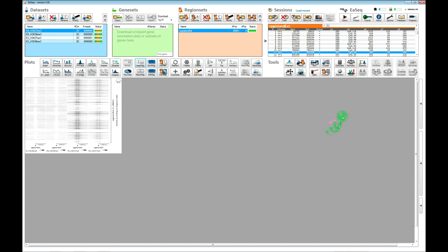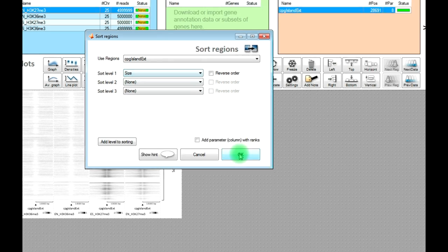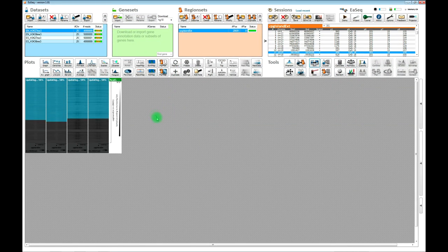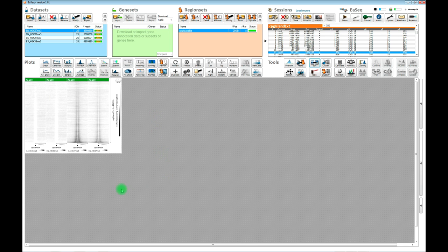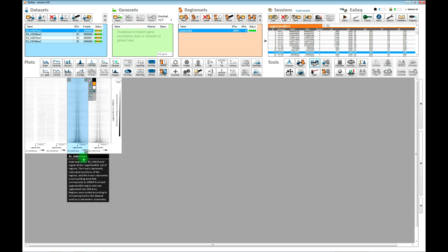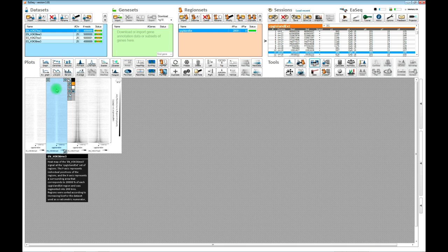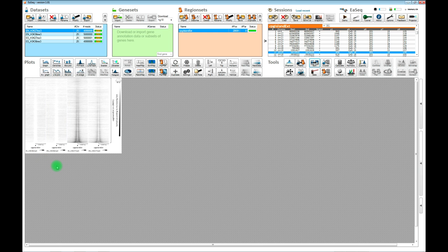If we wanted to change the order of the CpG islands, we can use this sort function here. We could say it might be interesting to change the order according to the size of the CpG islands. If we do that, EASEQ will automatically update the heatmaps — now you can see the broadest CpG islands at the bottom and the more narrow CpG islands at the top. You can also see in the heatmaps that there is an increased density around the CpG islands for the K27 trimethylation data, and that the CpG islands are devoid of K36 trimethylation — which is entirely expected from published data.